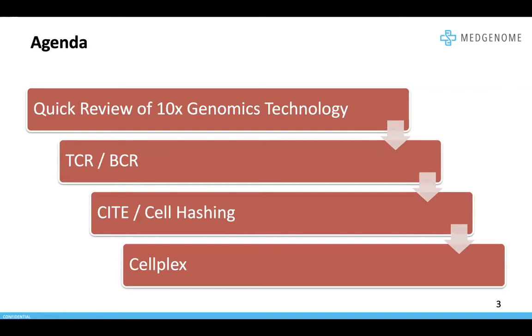So for today, I'm going to skip a lot of the basics on 10x Genomics chemistry and jump right into the various services that I plan to discuss. I do have a couple of introduction slides that I'll go over, but then I'll be going directly into the immune profiling kit to talk about TCR and BCR. Then I'll discuss CITE-seq and cell hashing. These are two methods that are very similar. They use antibodies to get the most out of single cell data. And then lastly, if there's time, I'll briefly go over CellPlex, which was just released last week, and it's a 10x Genomics product that offers an alternative protocol for cell hashing.